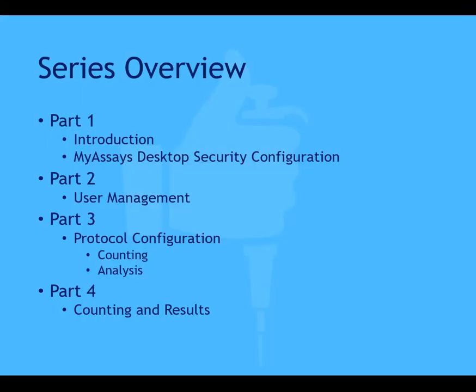In conclusion, in this video series, we've seen how to configure MyAssays Desktop Enhanced Security for working with the WIZARD2. We've seen how to administer and manage users, and also how to configure integration of counting and analysis protocols. We've also seen how different user types can work with the system.